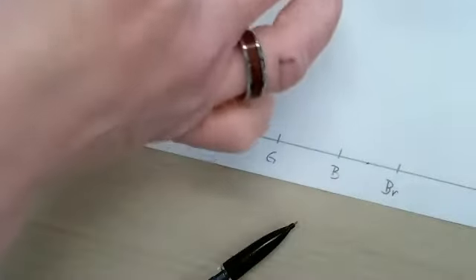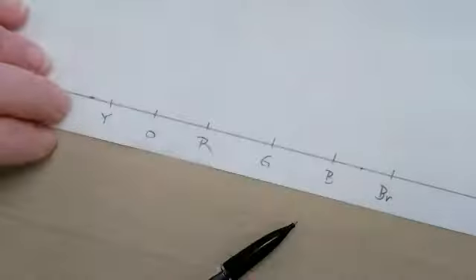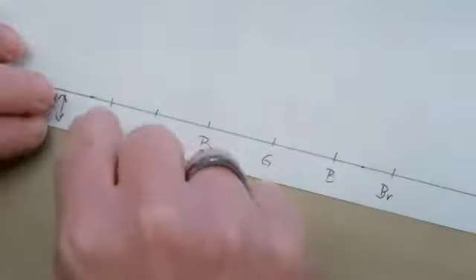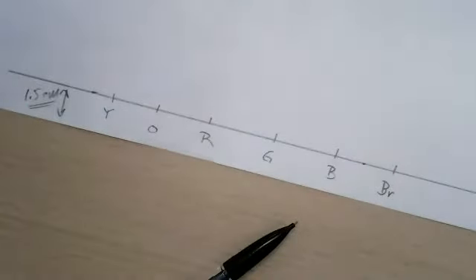Then it's up to you, but you can just put that back in because you'll need to share this with the other team, but also to make repeated applications like the procedure read. So you'll do the yellow, the orange, the red. If you want to switch with the other team, or just give this a wave. The alcohol will evaporate and be encouraged to evaporate with waving around. And if you kind of wait and wave it 30, 40 seconds, then you're ready to make your next application. And so on. So what you'll end up with is these beautiful color spots.